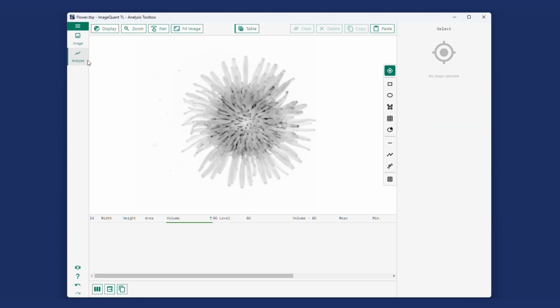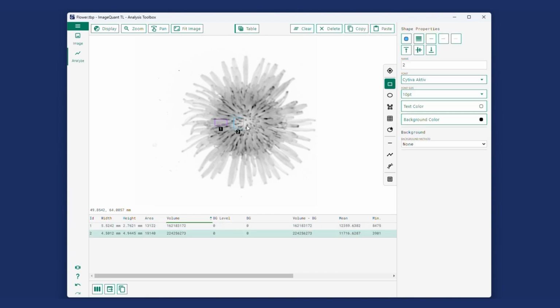In the Analysis step, there is a panel with different tools that can be used for analysis of any image. And you can open a TIFF file, which is what we recommend usually for quantitative analysis, but it is also possible to open other file types like JPEG or PNG. The most common type of analysis is to place various objects or shapes and then analyze the content or the pixels inside that shape. So it is easy, for example, to place rectangles like this for different areas.